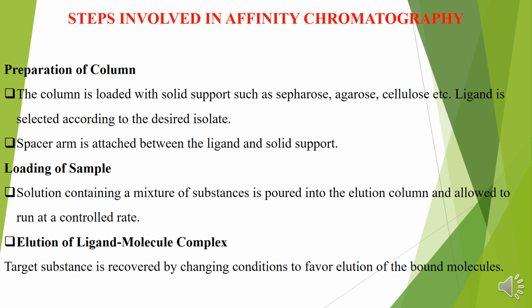While the first example of affinity chromatography exploited binding of the enzyme amylase to insoluble starch, it was the development of solid support materials and the chemistry used to attach ligands to these solid supports that truly enabled affinity chromatography. Since these seminal advances, there has been an explosion in the development of more support materials, affinity ligands and improvements in the method that make affinity purification an attractive approach to purify biomolecules from a complex mixture.